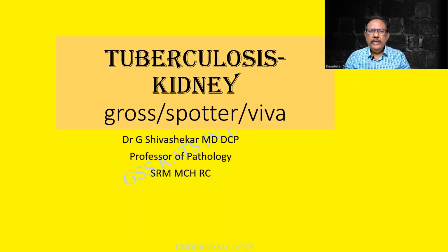The class for the day is spotters in pathology, namely tuberculosis kidney. This can be asked as a spotter. It can lead to a series of questions in Viva voce, or can be kept as a gross specimen for description. I understand it is a little off track, but since it has been included in the practical so far, I am taking this class.